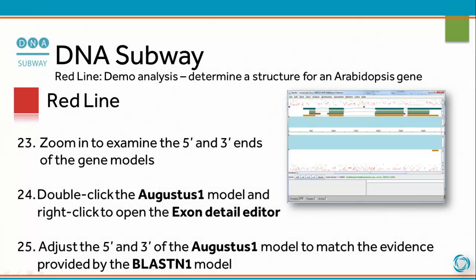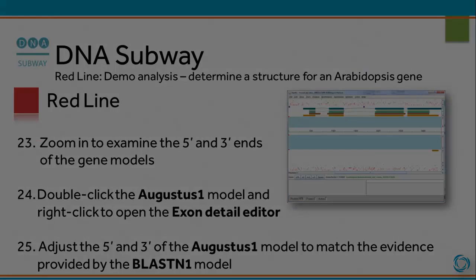Zoom in to examine the 5' and 3' ends of the gene models. Double-click the Augustus 1 model and right-click to open the Exon Detail Editor. Adjust the 5' and 3' ends of the Augustus 1 model to match the evidence provided by the BLASTN1 model.